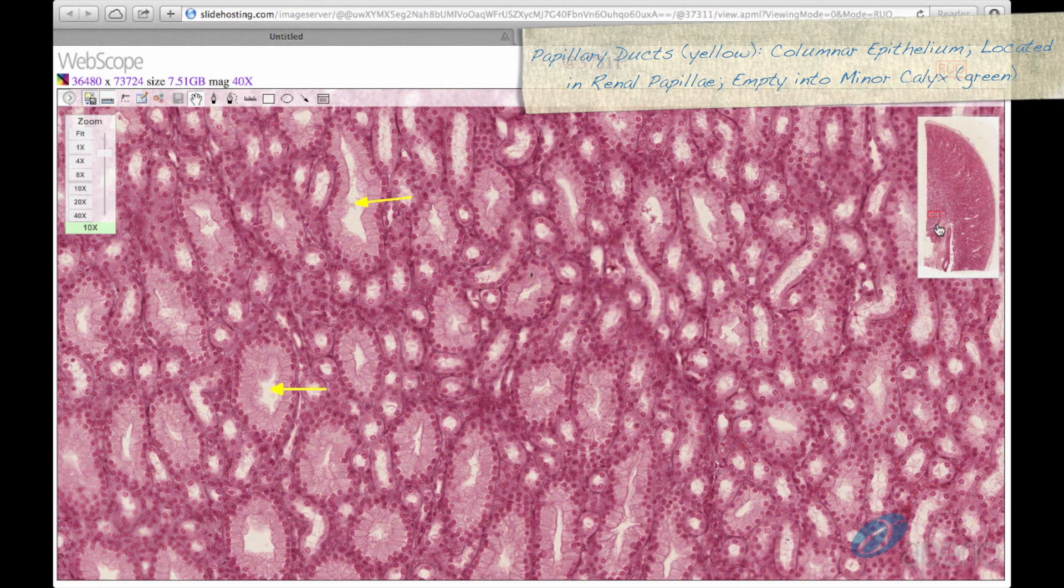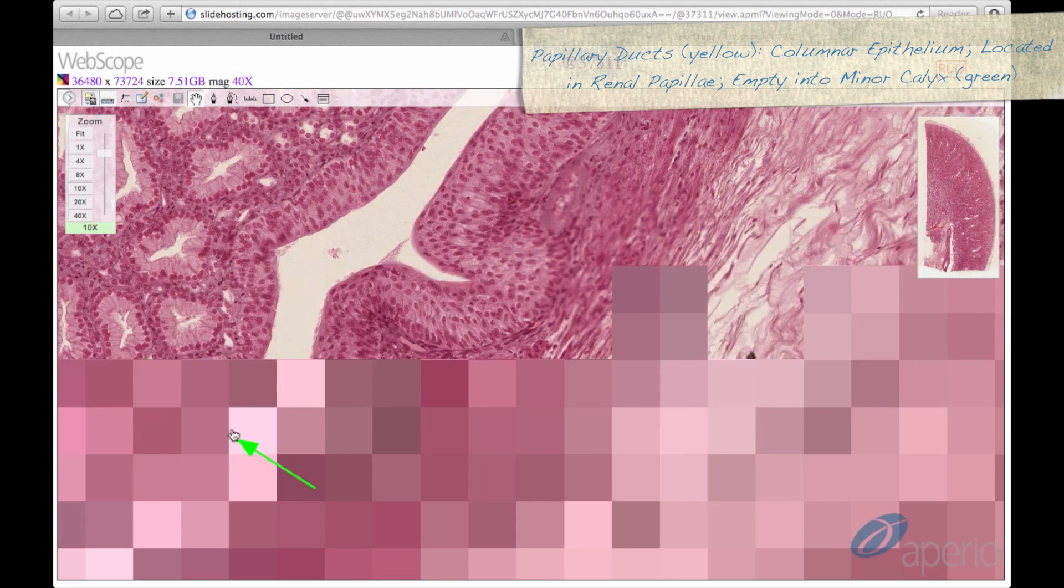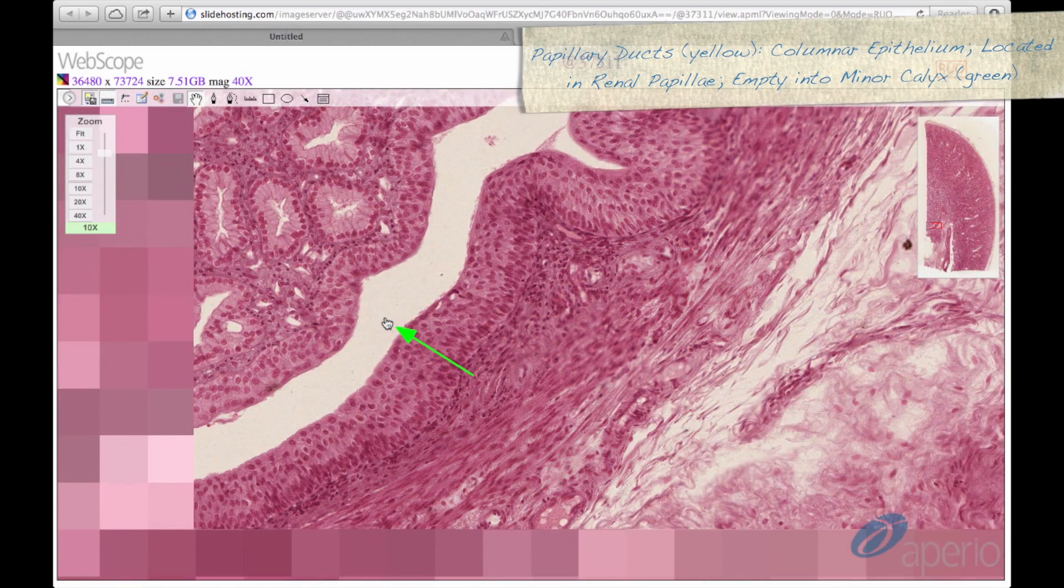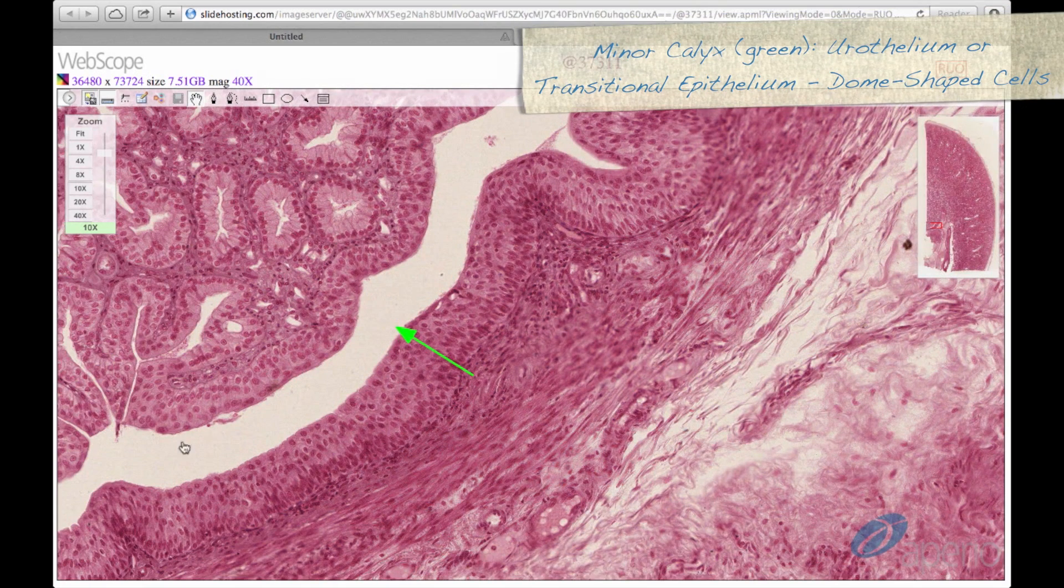The papillary ducts then empty into the minor calyx, seen here at the green arrow. The minor calyx will have urothelium, or transitional epithelium, which have characteristic dome-shaped or umbrella-shaped cells.